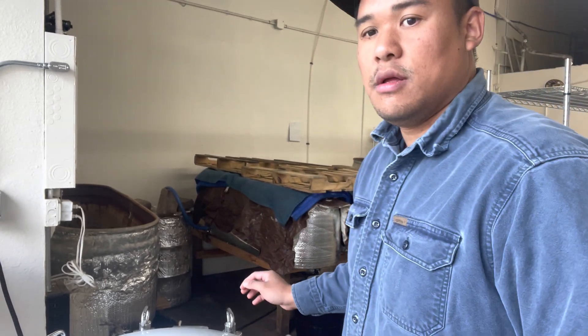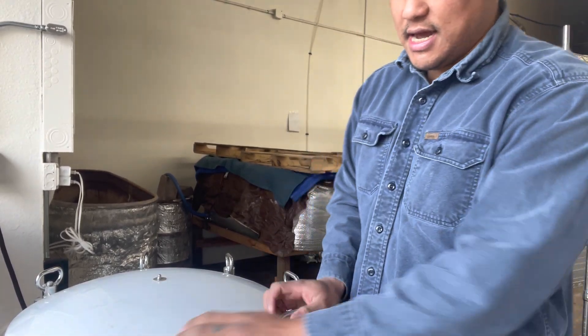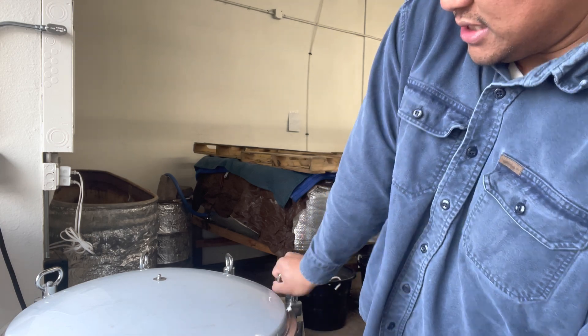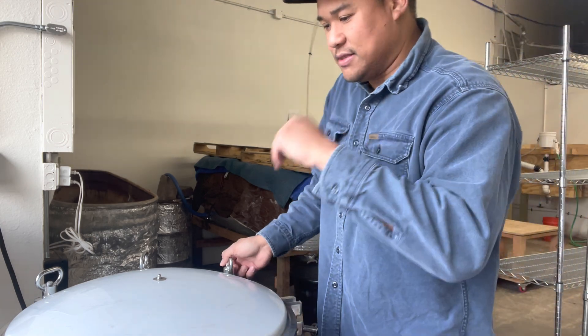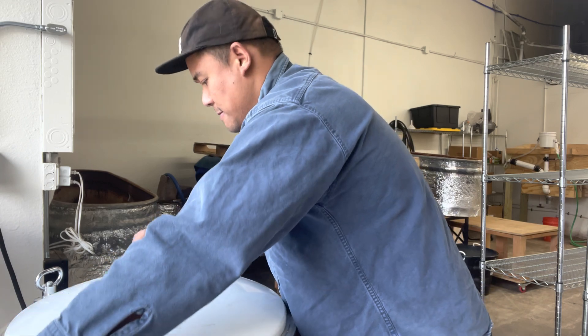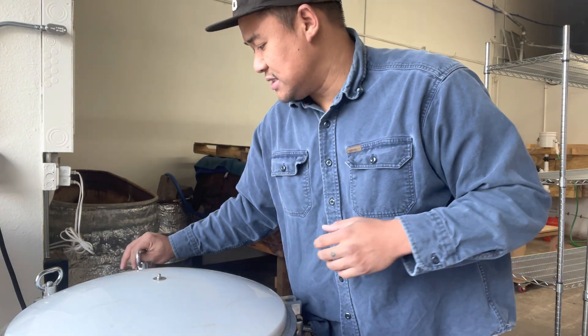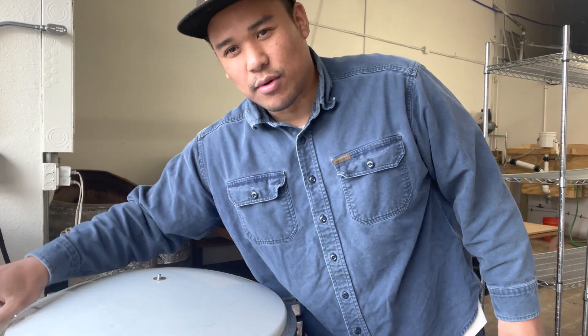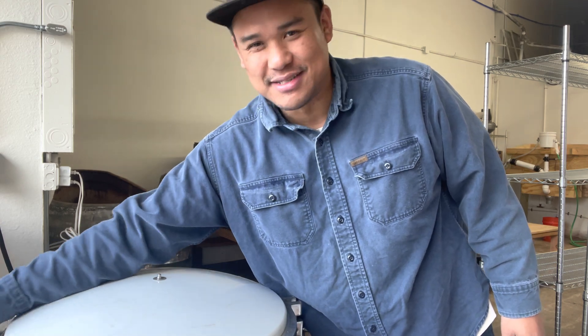I'll lift you guys up and show you the inside. It's got these twist-downs that are really convenient and easy to use. You just undo them - just like an All-American autoclave, same thing on top, except maybe easier to use. This machine is also on wheels, which is really nice - you can roll it in and out of your lab.